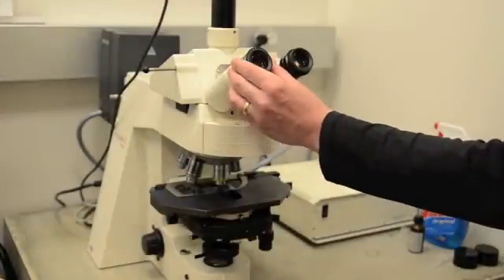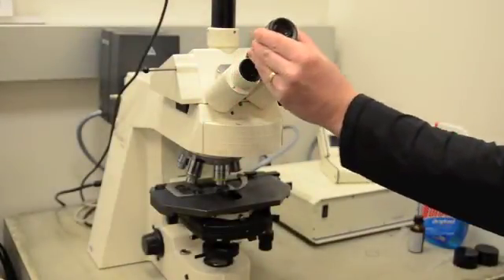Remove one of the eyepieces. With your eye about 20 cm from the eyepiece, adjust the condenser iris diaphragm so the light fills about 75% of the field of view.